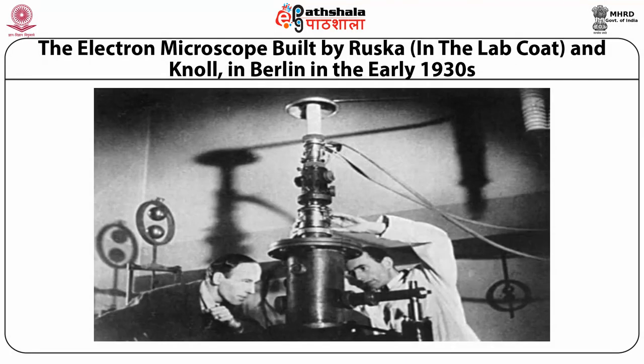I want to show the first microscope, which was built in Berlin by Ruska and Knoll, earning a Nobel Prize for Ruska.